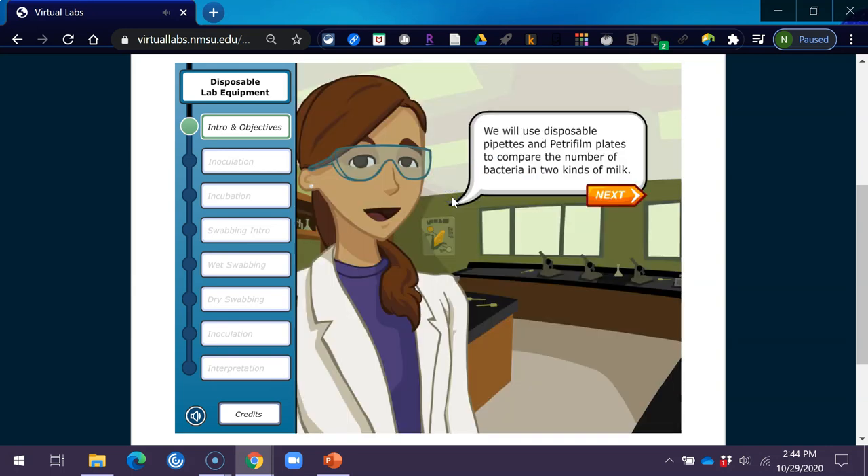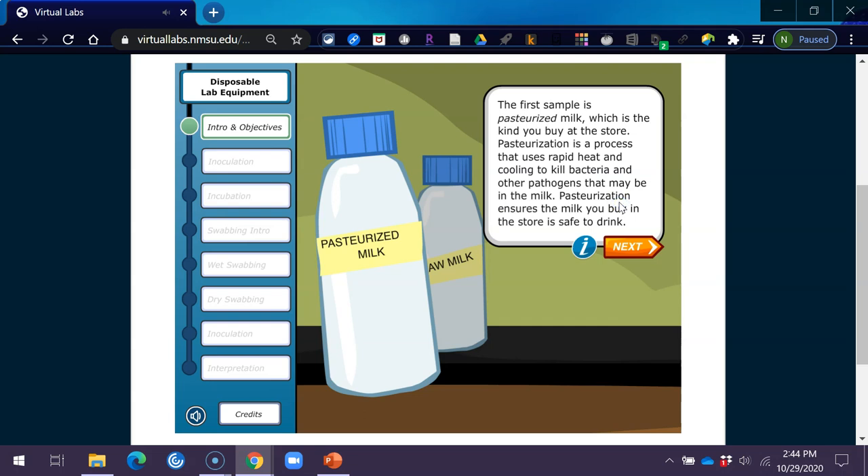We will use disposable pipettes and Petri film plates to compare the number of bacteria in two kinds of milk. The first sample is pasteurized milk, which is the kind you buy at the store. Pasteurization is a process that uses rapid heat and cooling to kill bacteria and other pathogens that may be in the milk.